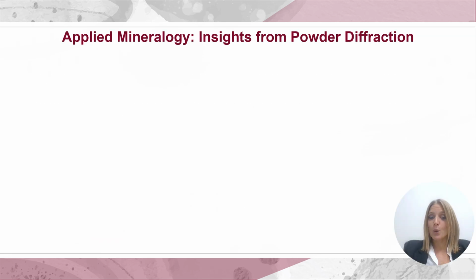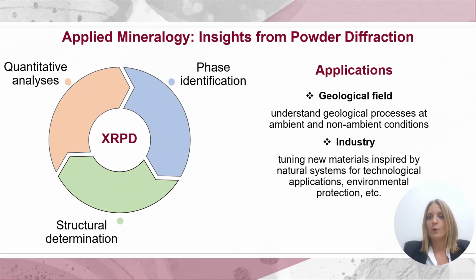I really hope you enjoyed these three examples. Today we have shown how X-ray powder diffraction can be applied to mineralogy using phase identification, quantitative analysis, and structural determination. These tools let us code mineral assemblages and track transformations both at ambient and non-ambient conditions.